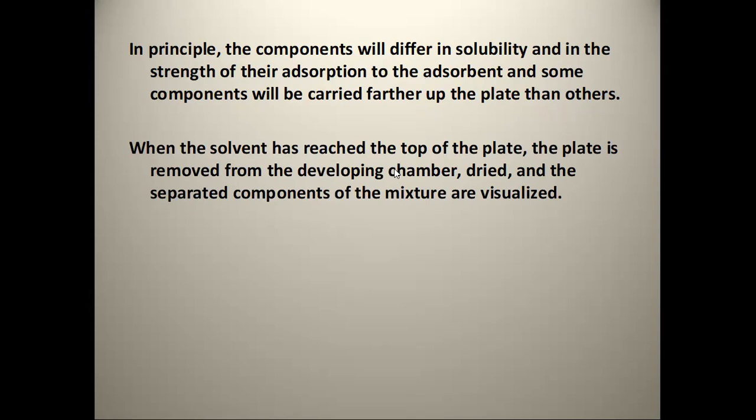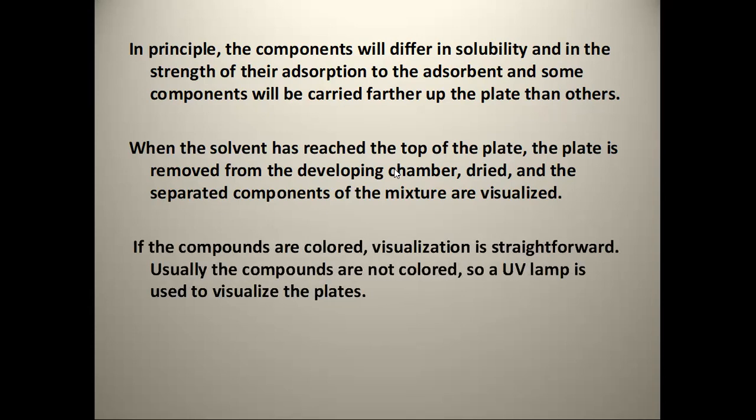So, ganun din sa paper chromatography, no? We dry them and then we look at the components. Kasi nga may color yung ink, wala tayong problema dyan. Okay? So, if it's colored, makikita agad kung saan yung pigments. Pero pag hindi, kasi yung mga organic compounds, madedetect yan ng UV lamp. So, using UV lamp, ma-visualize mo yung plate.